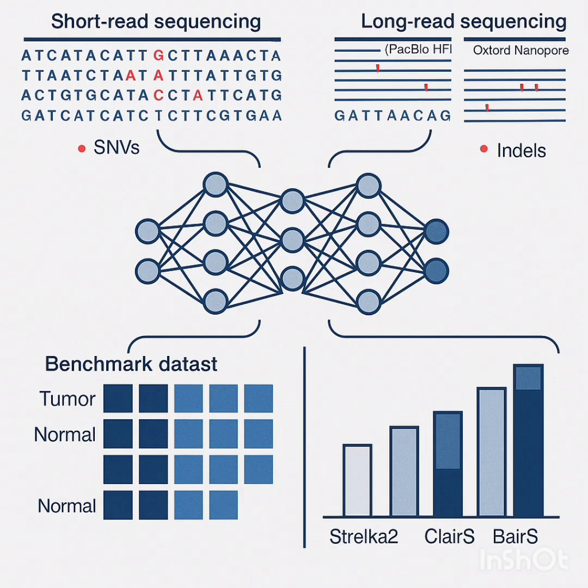Okay, so let's unpack how DeepSomatic tries to fix this. First, why are the standard methods, the short read callers like Strelka2 and Mutect2, hitting a wall? Well, look, they're really good tools. Don't get me wrong. For most SNVs, they're highly accurate. Strelka2 gets an F1 score of like 0.96 on that standard benchmark for SNVs. That's excellent.